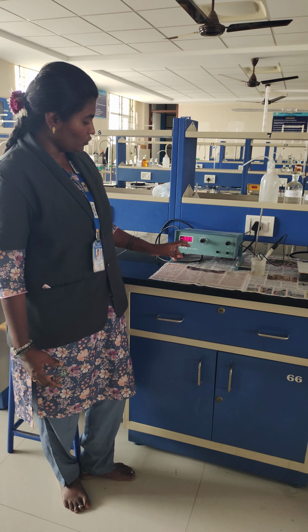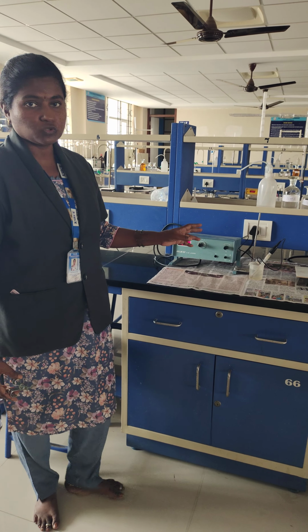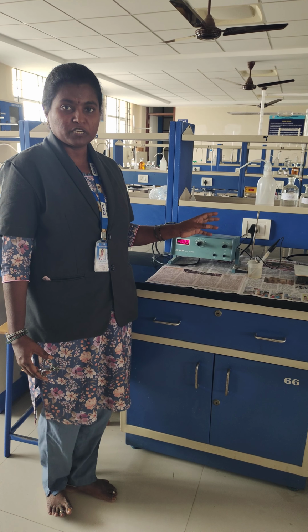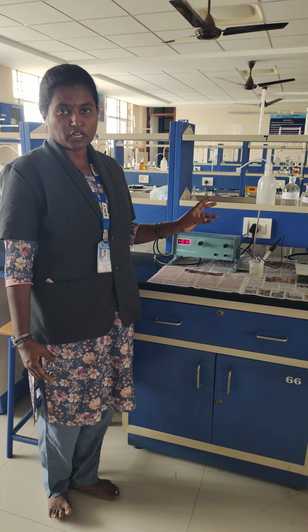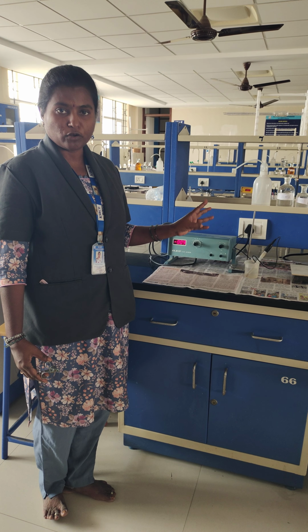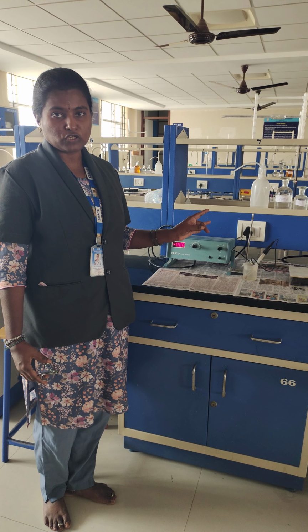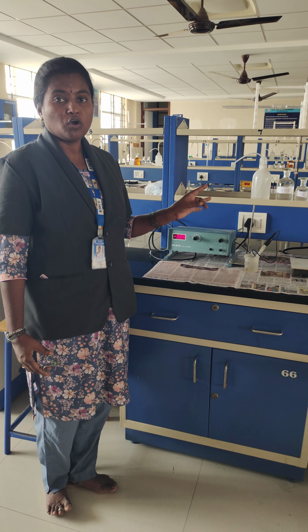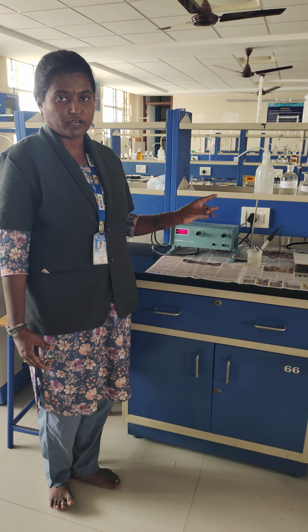The required amount of sodium hydroxide for this neutralization is considered as V2. We know the volumetric principle: V1 N1 is equal to V2 N2. V1 is the volume of hydrochloric acid, N1 is the normality of hydrochloric acid, and V2 is the volume of sodium hydroxide required for the neutralization of HCl.